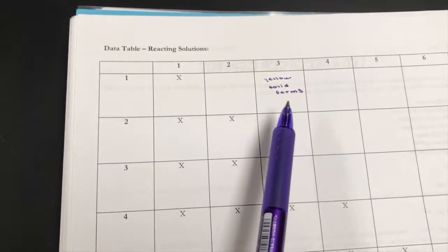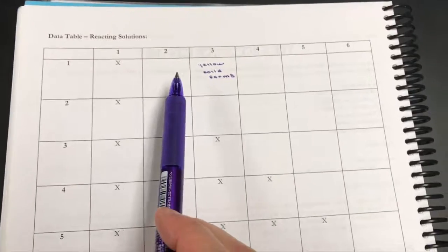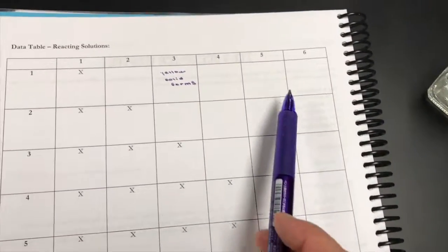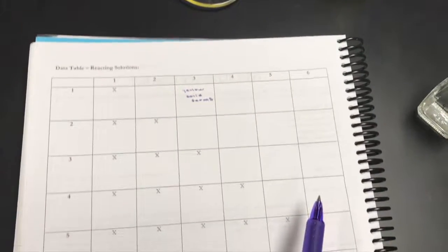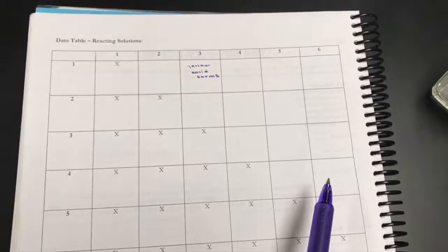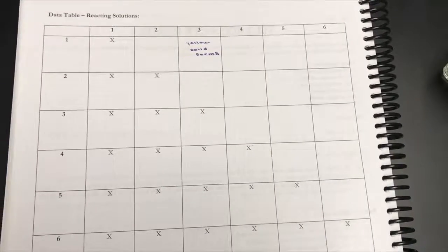Now you need to take all the other solutions and fill in these tables, and then based on this information and the information you got based on color, you'll be able to figure out the six unknown solutions.